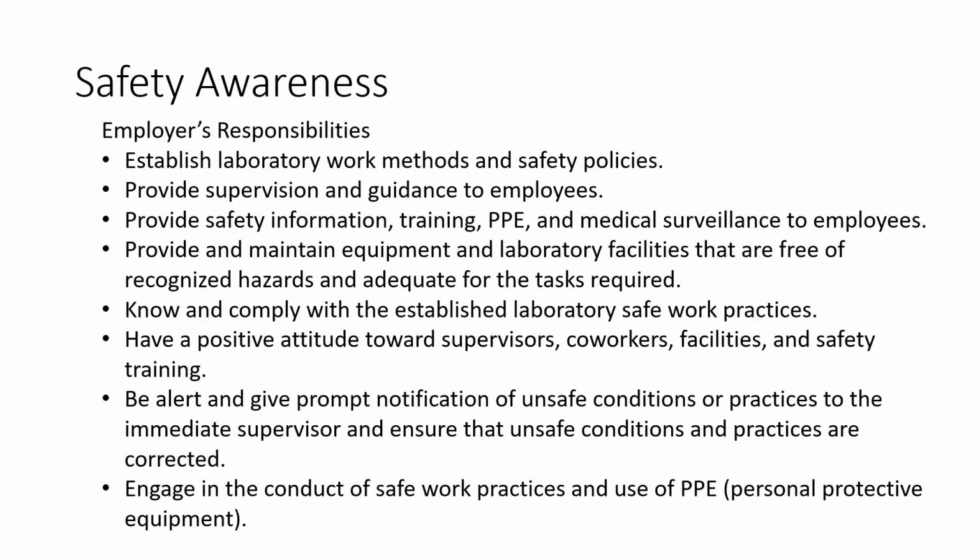So for safety awareness, the employer is responsible for establishing laboratory work methods and safety policies, providing supervision and guidance to employees, providing safety information, training, PPE, and medical surveillance to employees, and providing and maintaining equipment and laboratory facilities that are free of recognized hazards and adequate for the tasks required.